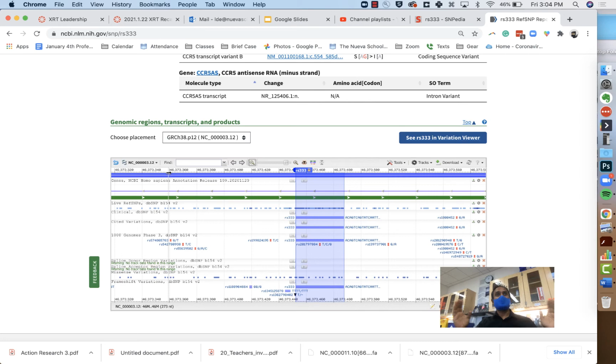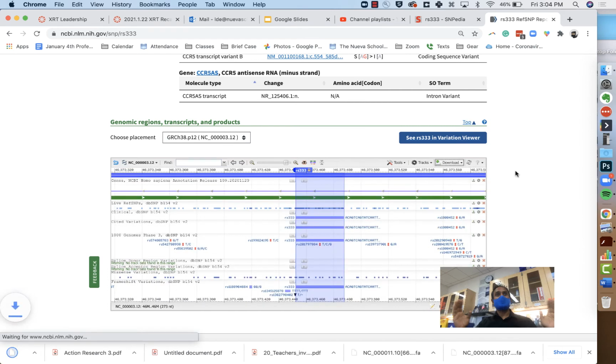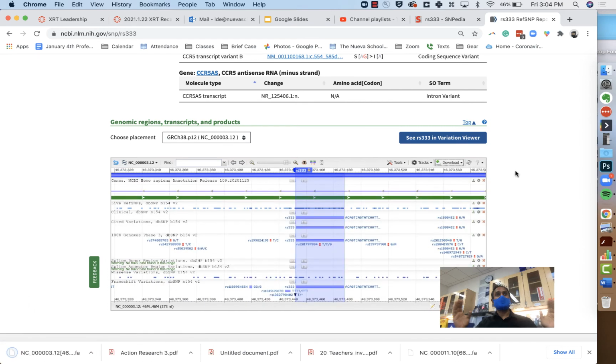I am looking at my genetic sequence, and now I need to download the letters. So how do we get the letters? Pretty simple. We go over here to download. We're going to download FASTA sequence, and we're going to download visible range. Cool. There is a little trick here that is really easy to bypass. This is going to save the file in a format that's not super helpful to me. So I'm going to need to change the format.